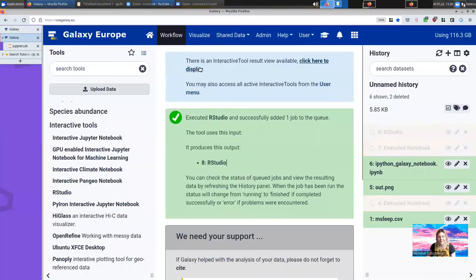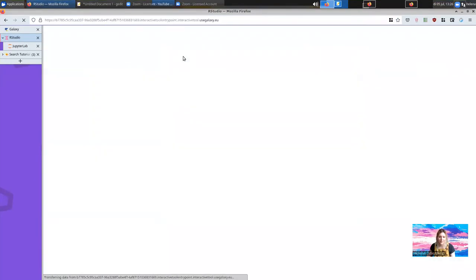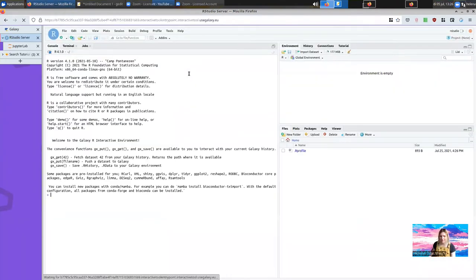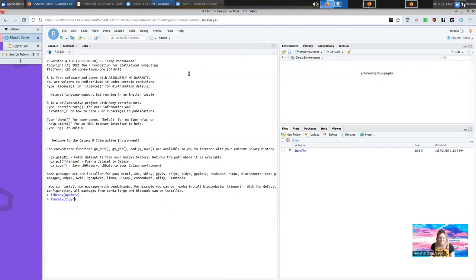When it's ready again, you'll see click here to display, and we can access RStudio. RStudio comes with a lot of the most common packages that you'll need pre-installed. So things like ggplot2 and tidyR, dplyr, all of these come installed ahead of time, which makes it easy to get started with your analyses.